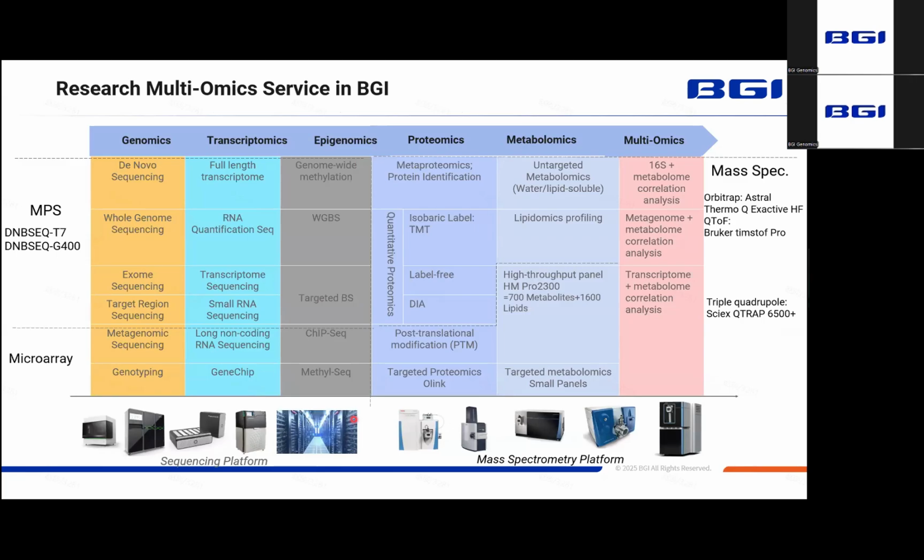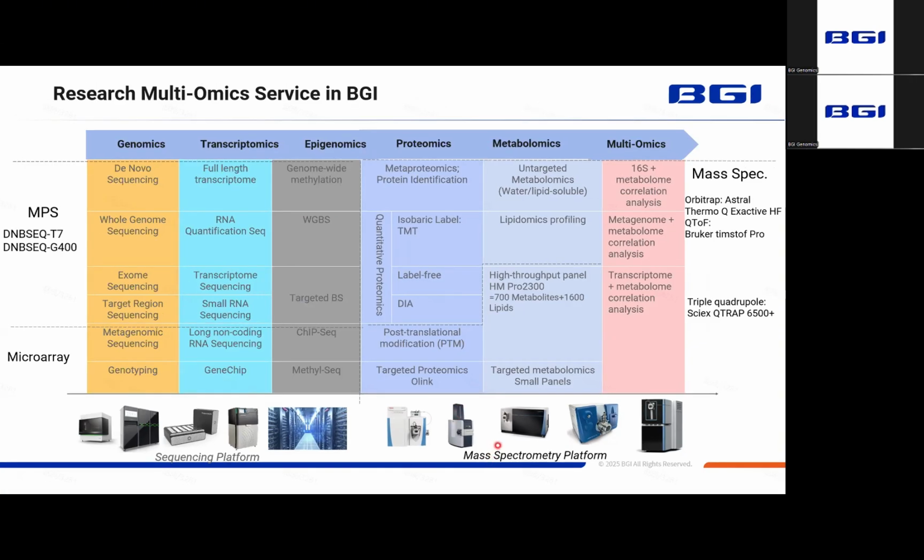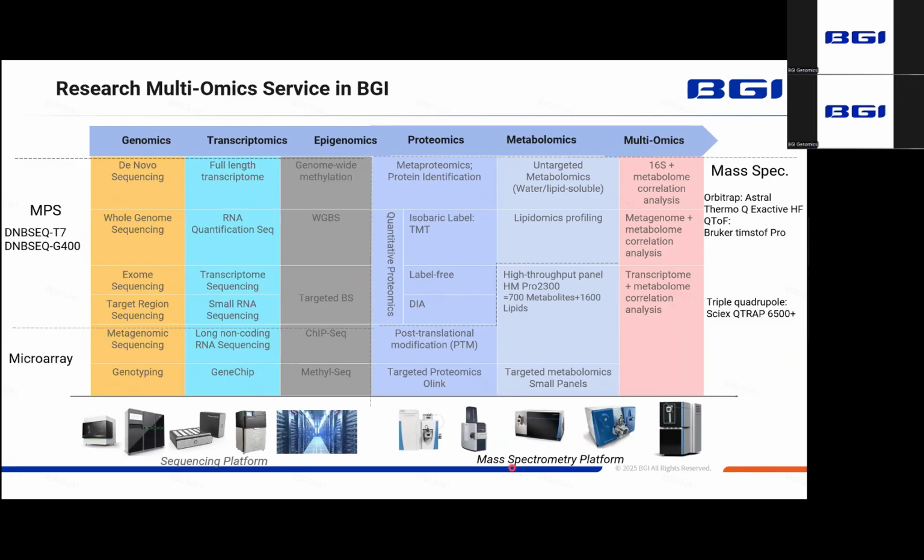The first step for generating the data is the appropriate instrument and method selection. This is based on the experimental purpose and sample type. I'm taking an example of our BGI lab. We have more than 45 different kinds of instruments, but it's not some collecting game. The truth is, each instrument or specific combination of them has specific limitations and strengths regarding accuracy, dynamic range, resolution, and the speed of analysis.